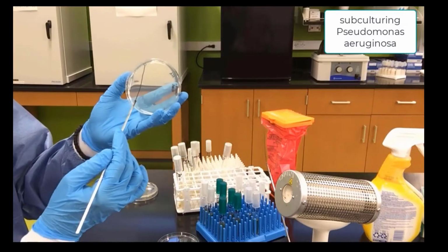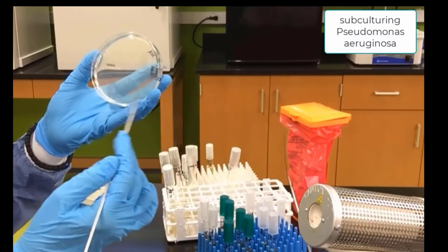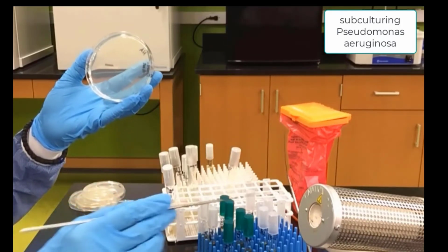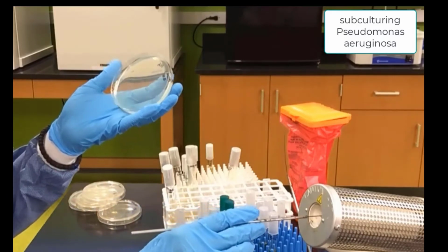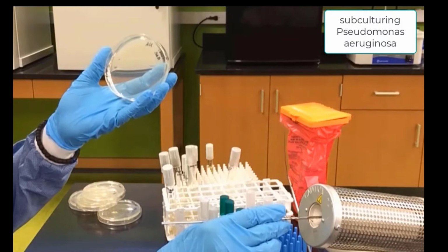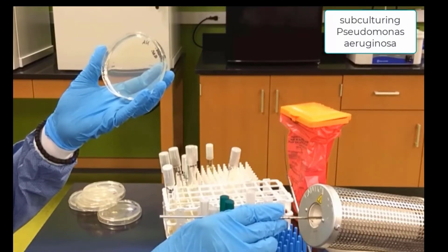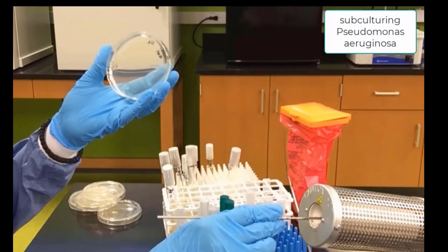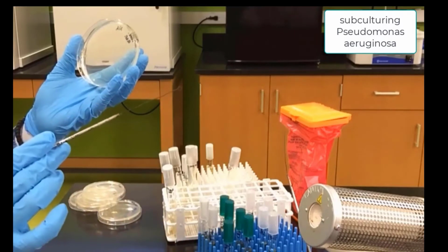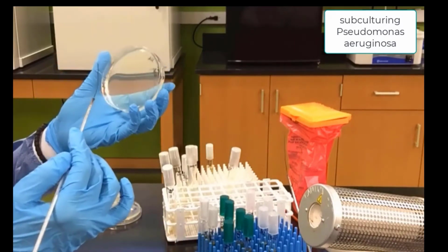With this plate we will be doing a 3-way streak plate. You'll notice we'll zigzag back and forth, skate on this nice agar, but not to pierce it until we reach a certain point. We will sterilize our loop. We will turn our plate 90 degrees. And after the loop has cooled, we will make a 2nd streak. We will drag bacteria from the first streak over into an empty space and do a 2nd streak.